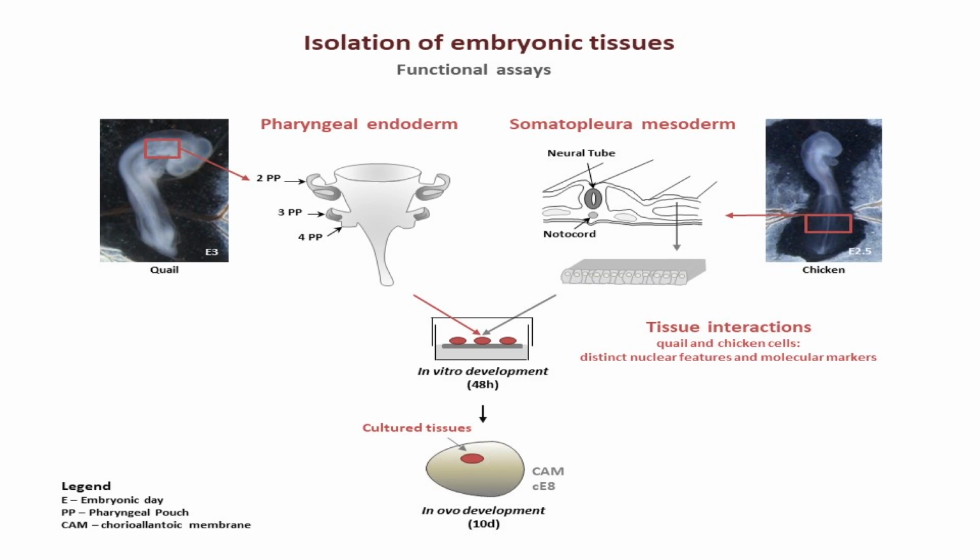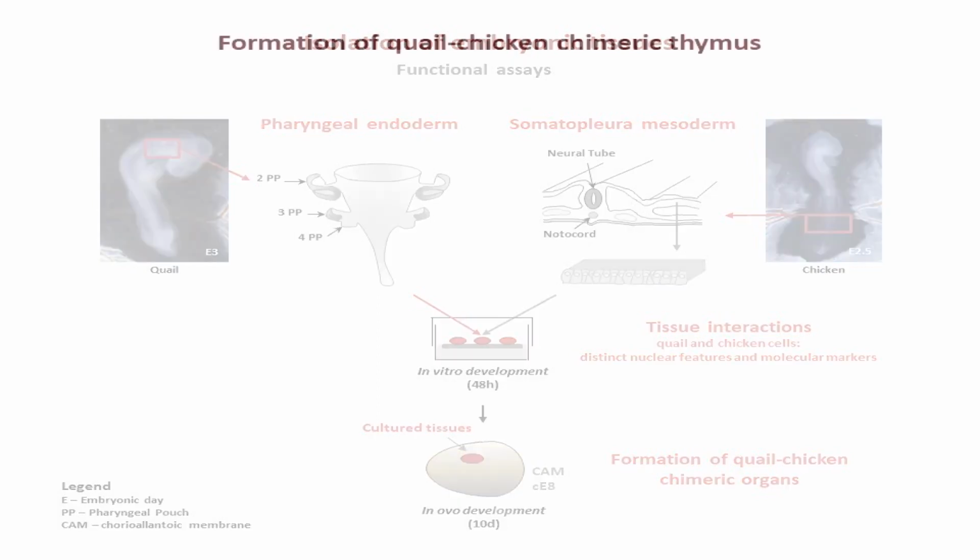assay. This method is, therefore, a useful tool for studying complex tissue interactions in developmental processes with highly dynamic spatial modifications and can also help to reveal the potential of specific embryonic territories to the formation of organs.